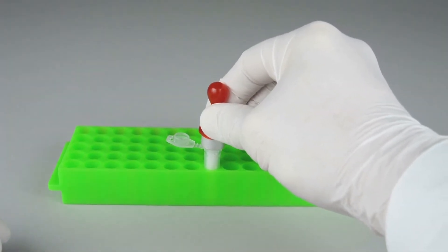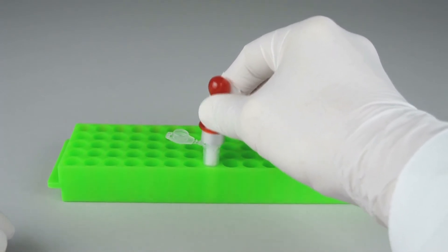Lift the puncher with the attached column and snap off the bottom closure of the column.